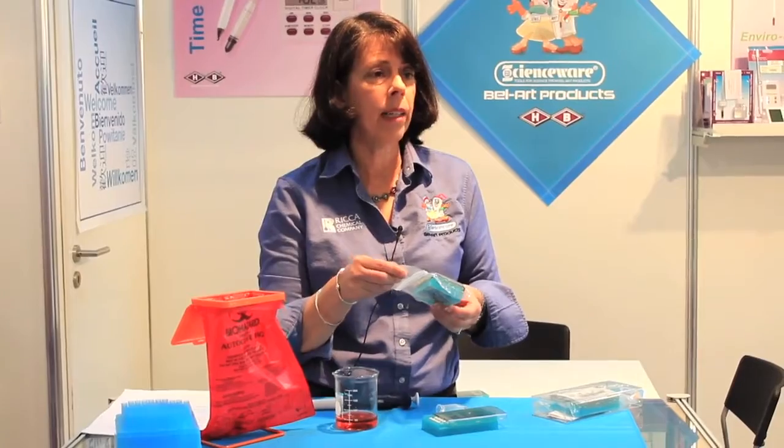FlowMe's are sold pre-sterilized in trays of 50. Each tray is packed in a Ziploc bag. You can maintain the sterility by working in a laminar hood.